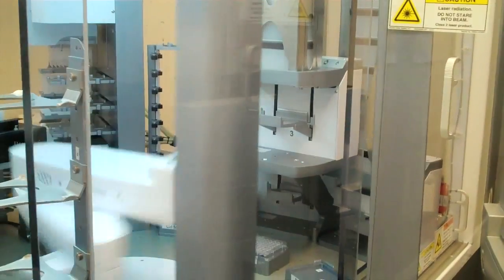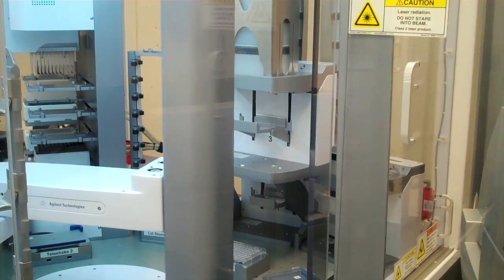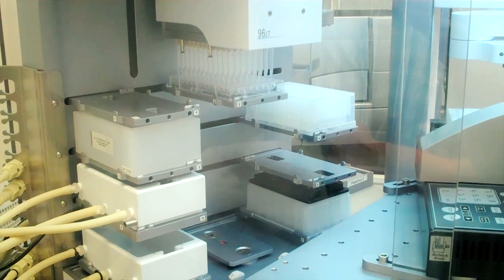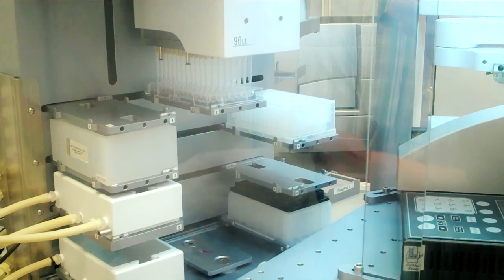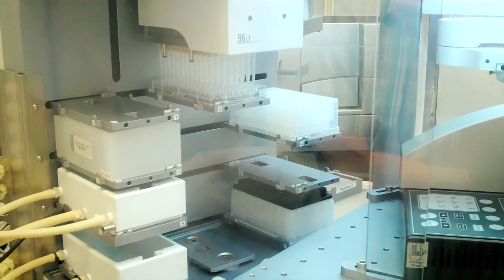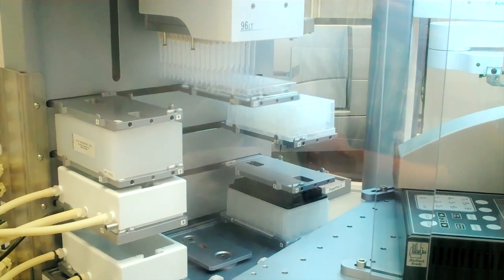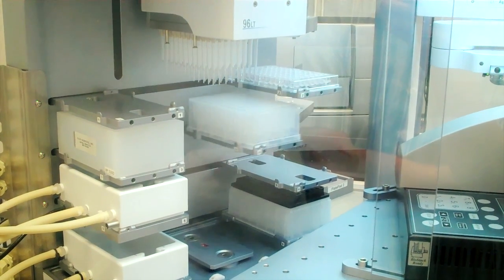yeast strains, and it's asking actually a very simple question. Which genes do these individual transcription factors, all 2,000 of them, bind to and regulate? The robot can do overnight what it would take tens and tens of graduate students to do in several weeks.